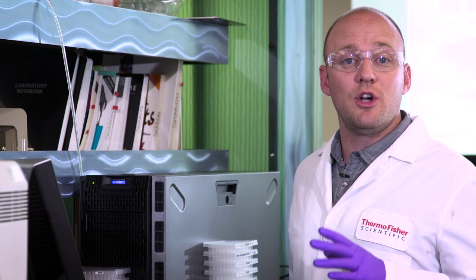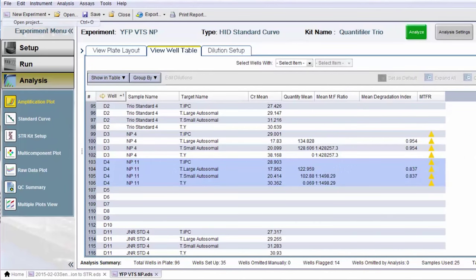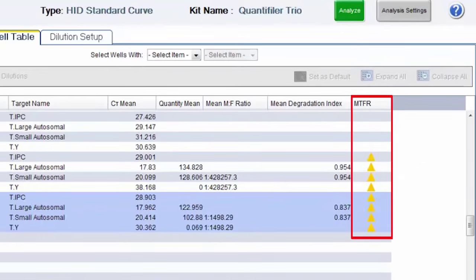So let's go back to the Trio quantification result to see what it tells us. Here it's flagging the male-to-female ratio. This alerts the user that the sample in question has a low male-to-high female ratio and a YSTR kit would be more appropriate.